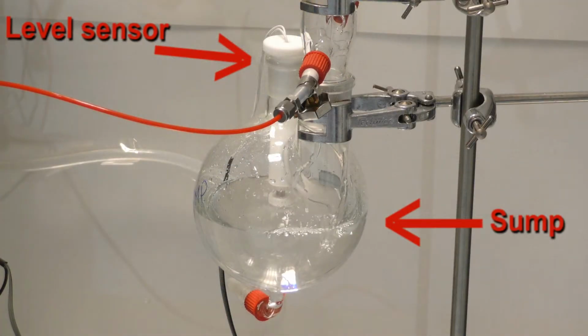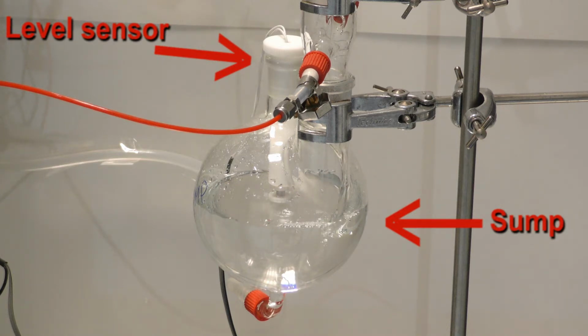Below the column, we have a special glassware called a sump, which is to collect the water flowing down from the column and keep a steady, more or less constant liquid level. There is a level sensor at the glassware, which is to detect the level of water in the glassware. When the water level reaches the limit, the valve at the bottom of the glassware will be triggered to drain the water away to the tank.